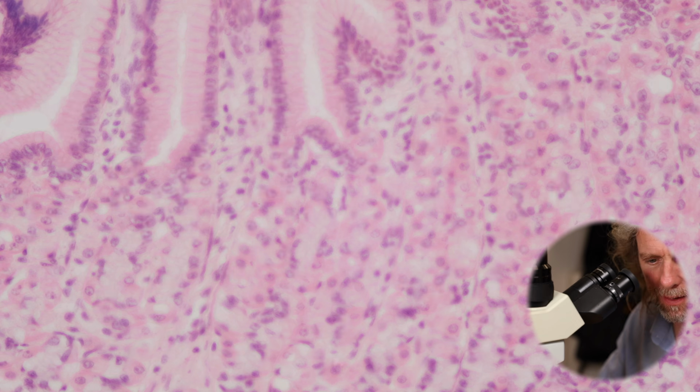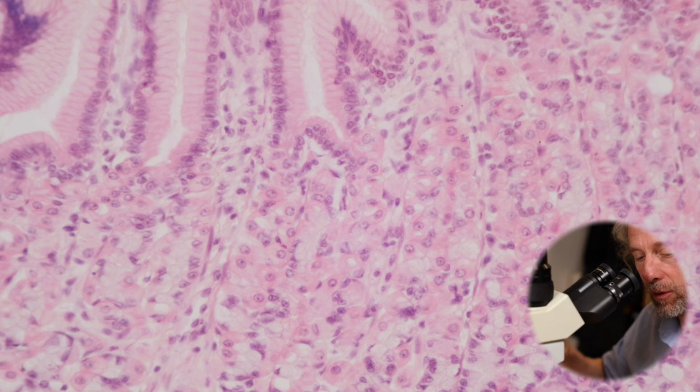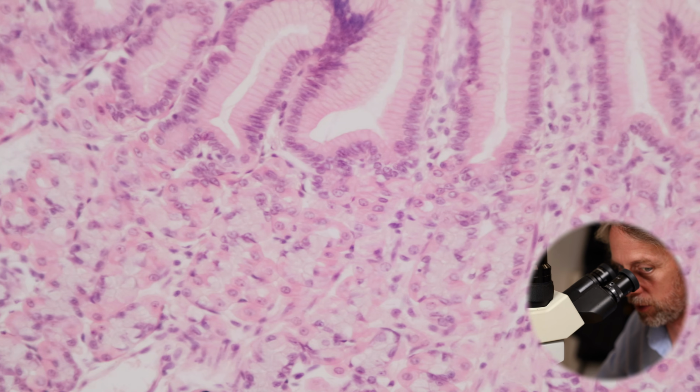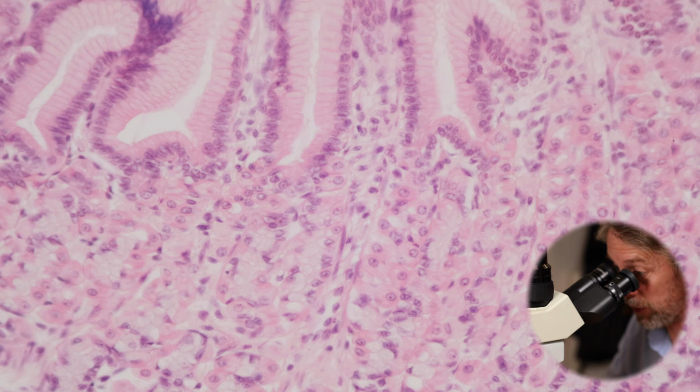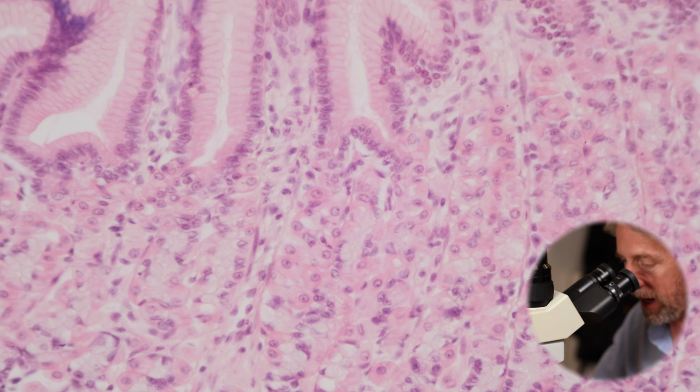Can you imagine that little, can you see that? We've got a little bit of a branching one there, right? Can you imagine how those branches are continuing out? We've got another one a bit further along, right? Can you imagine how those branches are continuing? That's what we mean by the gastric glands as we get down there.